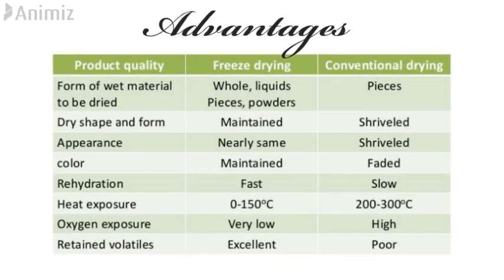Here we can see a comparison of the freeze drying technique with other conventional drying techniques. Apart from other advantages, we can see that the oxygen exposure is very low in the case of freeze drying, which is high in the case of conventional drying. So if the product is degraded by oxidation, freeze drying is the method of choice. And also freeze drying can retain the volatility of the product, which is poorly retained by conventional drying techniques.